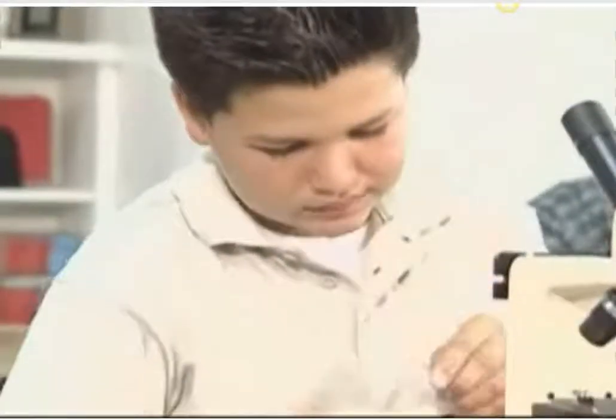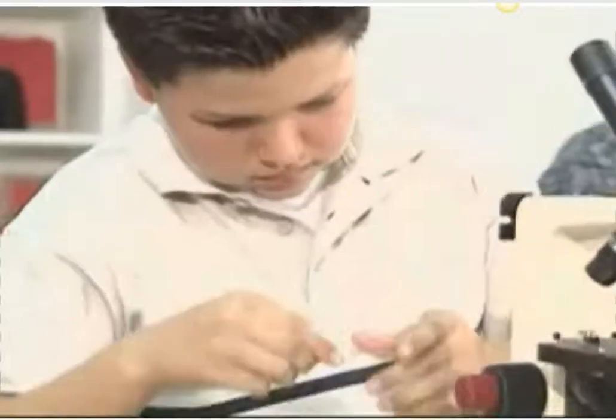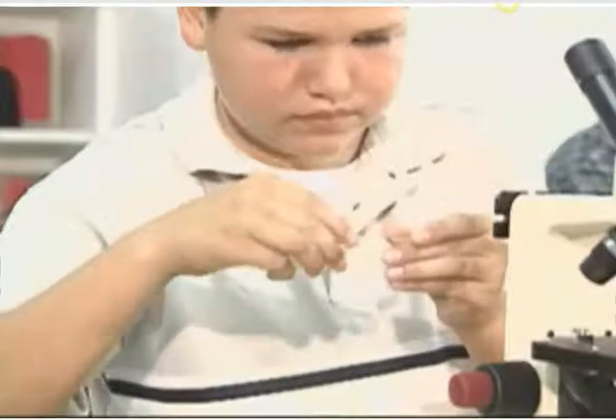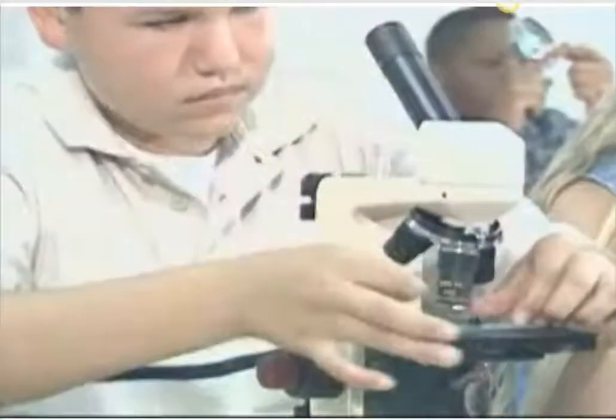Now try this. Scrape a little material from your teeth using a clean toothpick. Dab this onto a glass slide. Add a cover slip, and place this under your microscope, set to the highest power. You should be able to observe plenty of bacteria. They're the tiny specks jittering about between the cells. Bacteria are among the world's smallest organisms. These bacteria are relatively harmless. Some, however, are deadly.